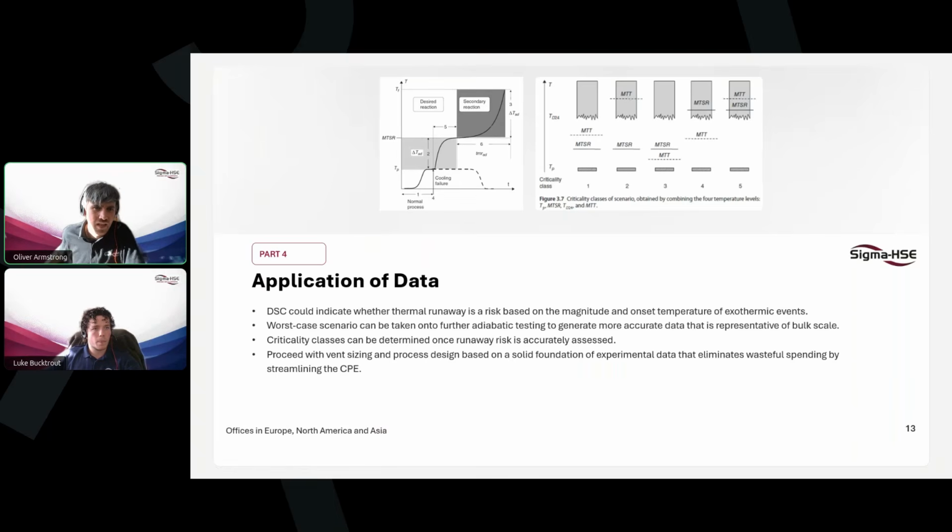Yeah, great summary, and Luke has neatly tied together there all of the key material properties that we've explored today and their characterization with DSC, and how we might consider each of these in isolation or in conjunction, using them all together to give a full and appropriate chemical process evaluation.